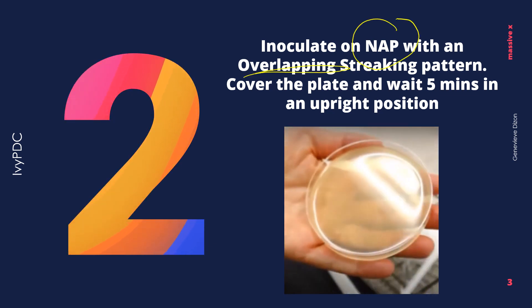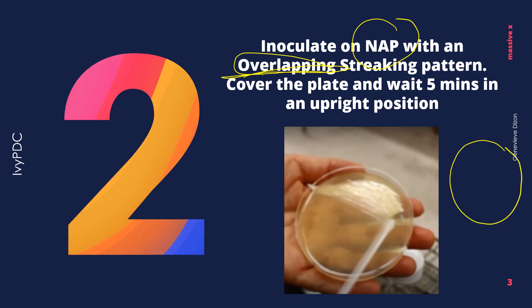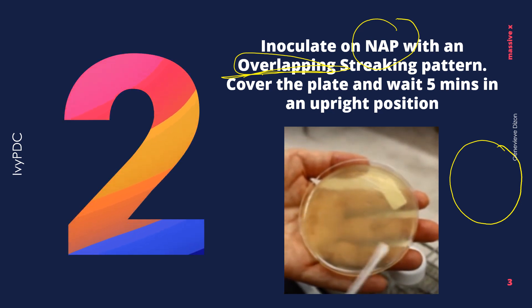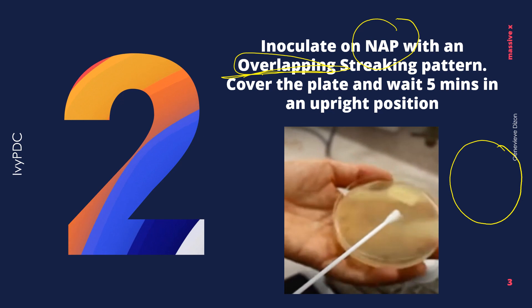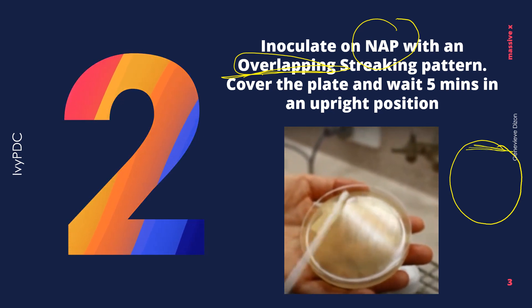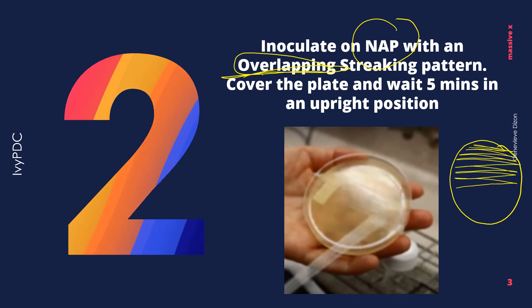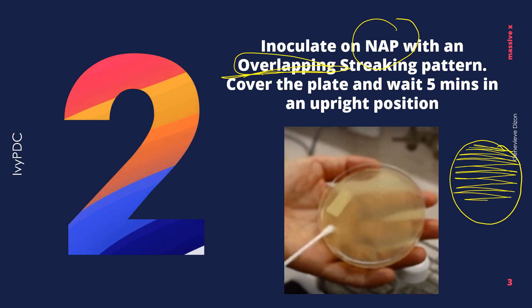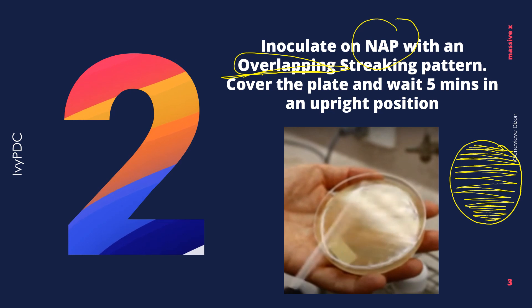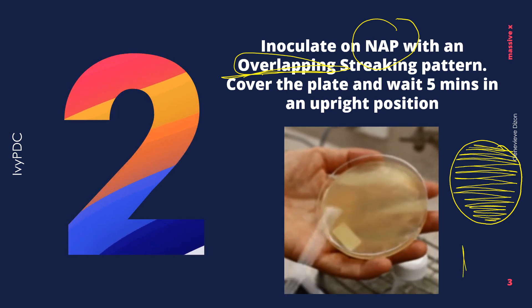The second step is the inoculation of the nutrient agar plate using your swab with an overlapping streaking pattern. To perform the overlapping streaking pattern, four streaks should be done in one petri dish. For the first streak, position your swab on the upper left-hand corner and then start moving from side to side in a zigzag manner, going all the way down, making sure that there are no spaces in between.